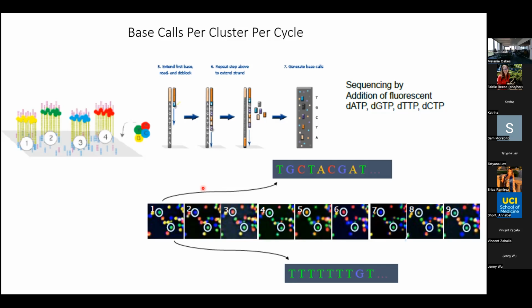On read 1. So where people would want, for instance, paired-end 150, which is what we can do here, I'm going to advise them to make sure their insert size is big enough. You'll probably get some adapter sequence anyway, but to get the most bang for your buck, you want your insert size to be at least 300. And sometimes for genomic assemblies, they actually like to sequence over a little bit, so that read 1 and read 2 repeat some bases in the middle. But we're still looking at something that is at least 300.